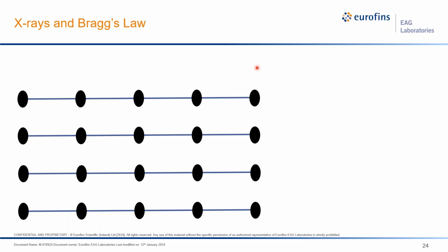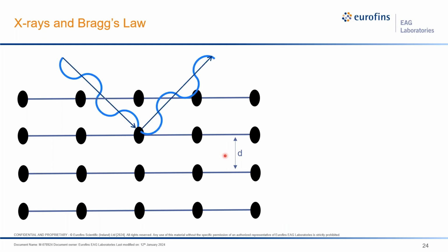And I promise this slide is the only math you're going to have to look at, but I really wanted to discuss diffraction and why this is such a powerful technique. So here we have a crystal lattice structure, and these are planes, and these dots are basically symmetrical repeating nodes. They don't have to be atoms, but essentially you have long range order, and the distance between these planes of repeating structure is called the D spacing.